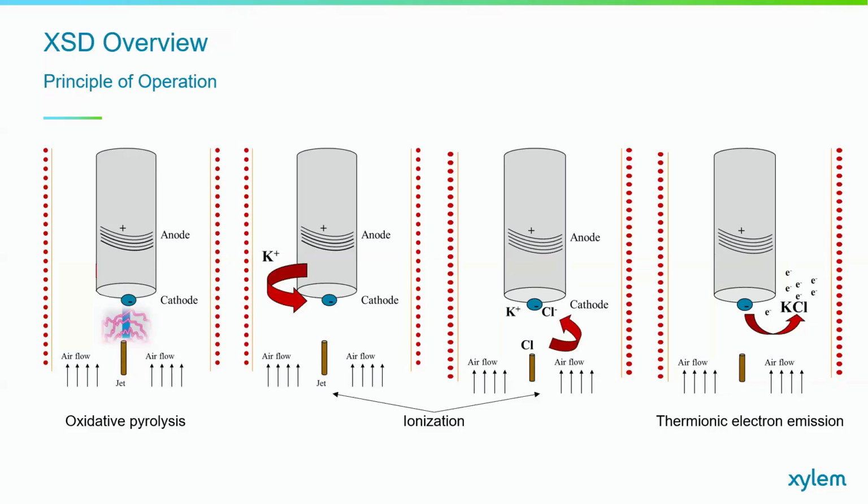So oxidative pyrolysis. This is the process where organic materials are broken down at high temperatures in the presence of a controlled amount of oxygen. So oxidative pyrolysis involves oxygen influencing the reaction pathways and product distribution. And you may be asking, how is this different than combustion? Combustion is a complete chemical reaction. Oxidative pyrolysis is thermal degradation of the material because of oxygen. So you can think of it as an incomplete combustion. This is just oxygen's present impact on thermochemically decomposing a material.